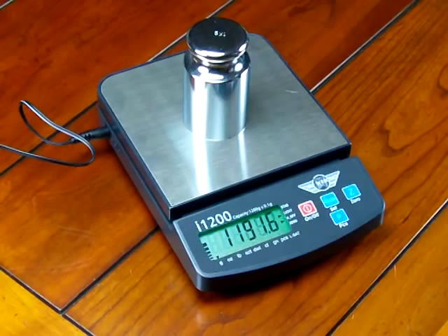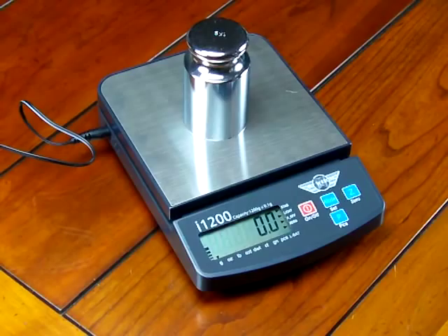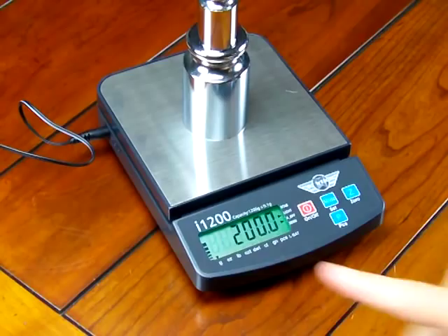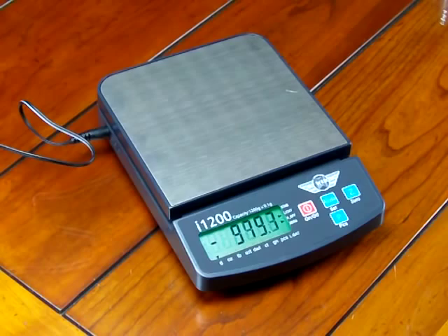Sometimes a person might want to use this weigh meter — for example, if I had a thousand grams and I zeroed it out and forgot exactly what I have on the platform, I'd be looking at this weigh meter. I just zeroed out or tared the one kilogram weight, and if I put on 200 grams, the scale shows it, but the weigh meter is telling me I'm at capacity. That's a nice unique feature of the MyWay i1200.